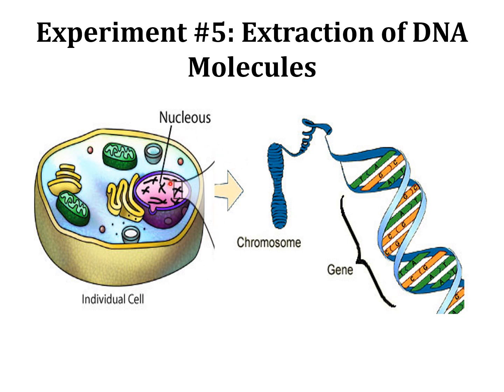After we break the cell membrane and the nuclear envelope, DNA is released, and then it is purified, and then we can do different analysis with this pure DNA. So this is the aim for today, guys, to get purified, pure DNA. We want to get pure DNA so we can use it for PCR, for diagnosis, for genetic tests, to study diseases, etc. So we have to use innovative molecular biology techniques.